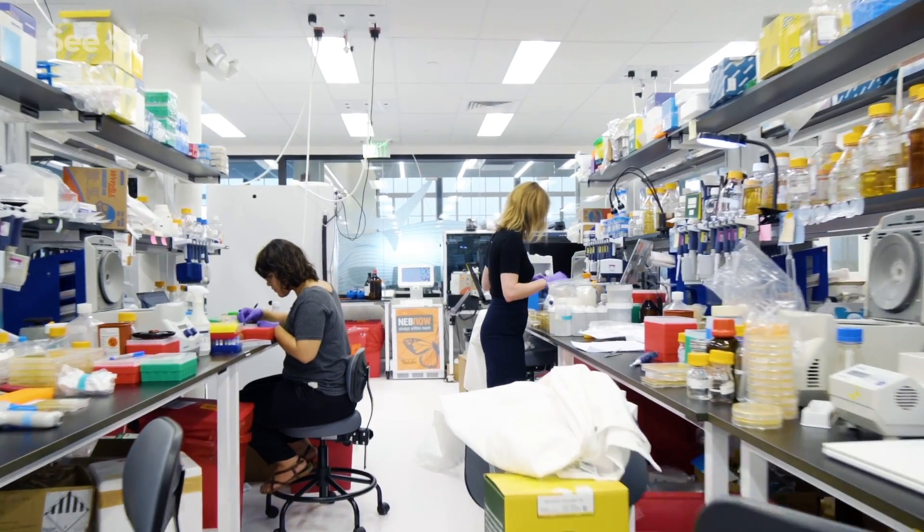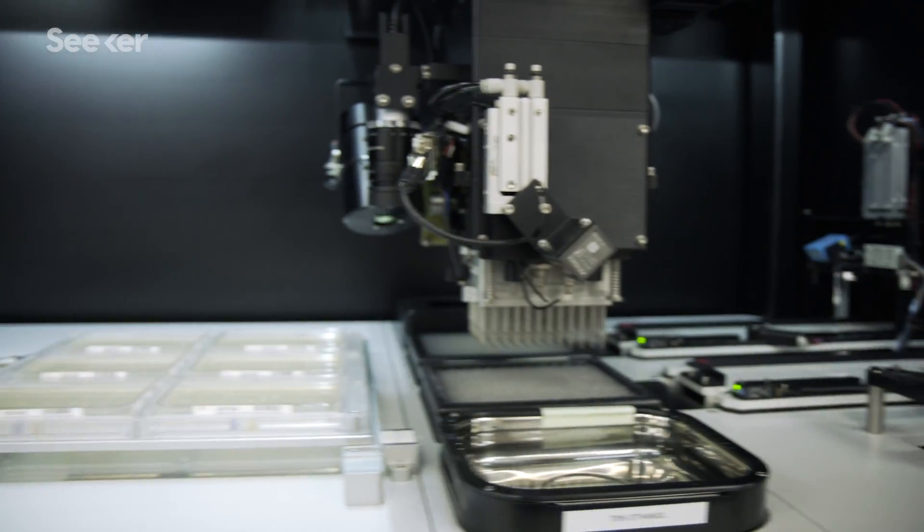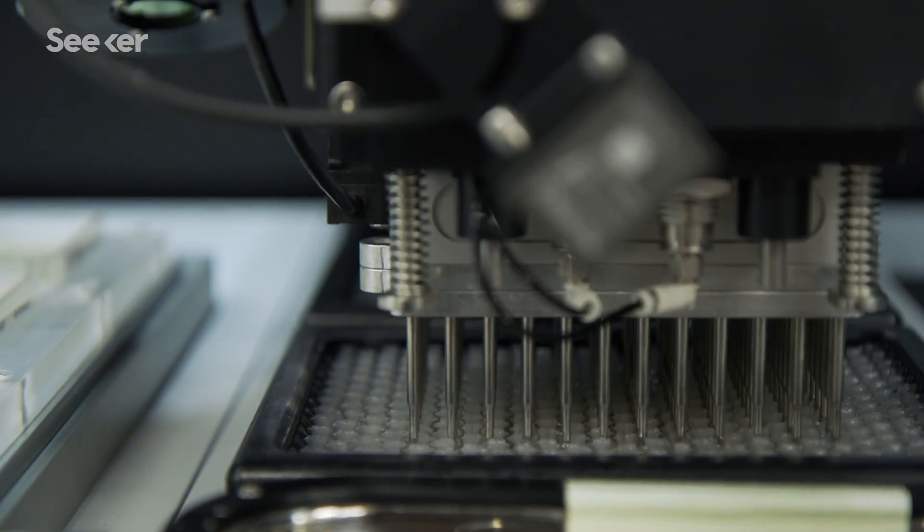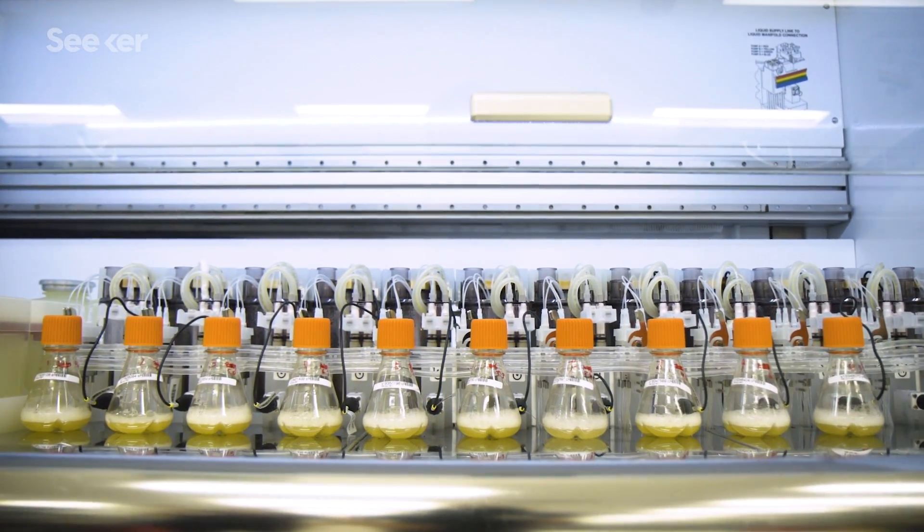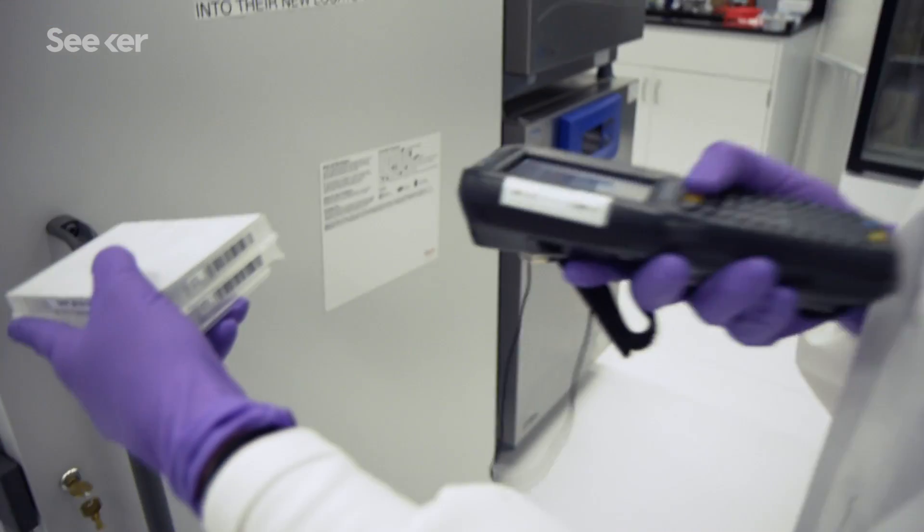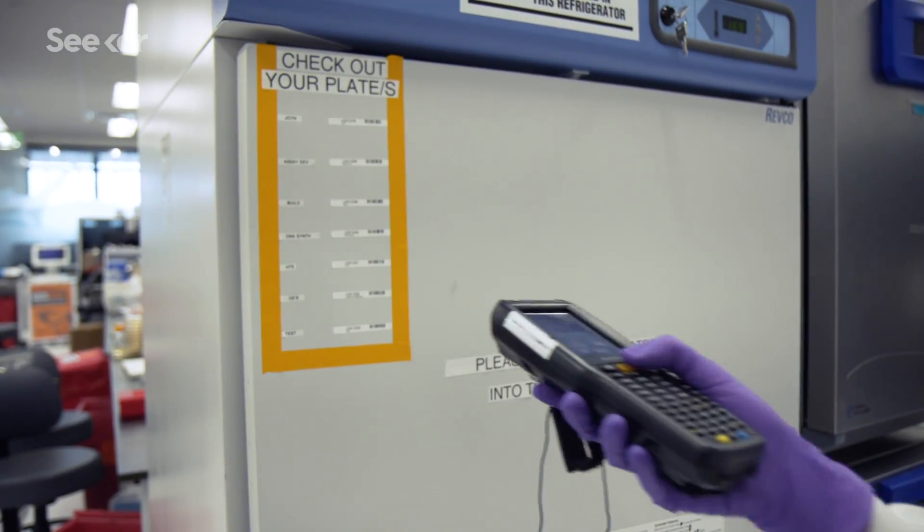They're taking synthetic DNA, remixing it, and programming microorganisms, turning these living samples into tiny factories that could one day pump out new foods, fuels, and medicines. Every piece of DNA here is barcoded and catalogued in what's considered the world's largest genetically engineered strain bank.